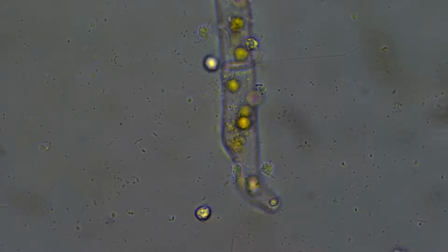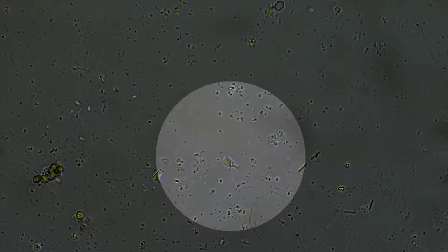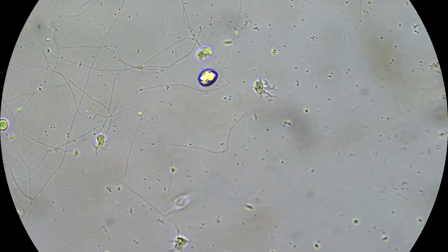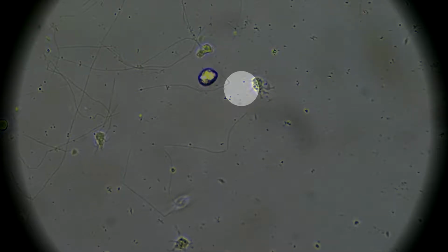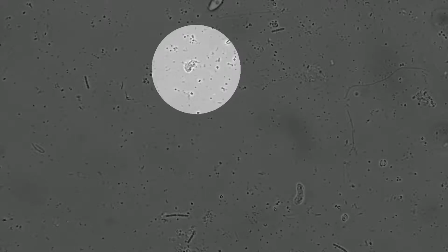Anyway, I'm not certain about the identification of this. I've gone online. I've looked through the literature. It's very suspicious. So you have to look really, really closely to see the flagella. But see it? At first it's kind of hard to tell because they're sending out these little spidery looking pseudopodia, which are just the regular little amoeba arms. And this one has little thin, stringy ones that you could mistake for a flagella. But once you see it, you can see that the motion is a lot different. There is a definite flagella sticking out of this amoeba. See it there? These amoebas definitely have flagella.